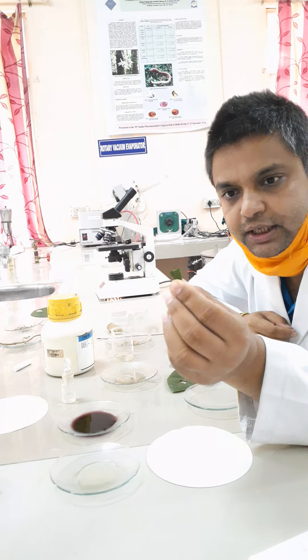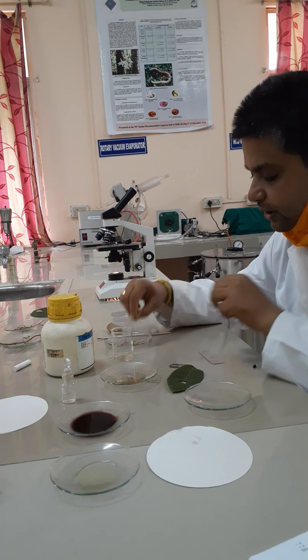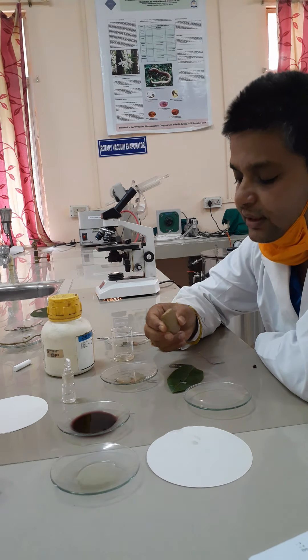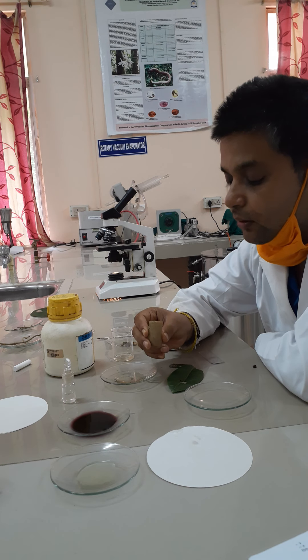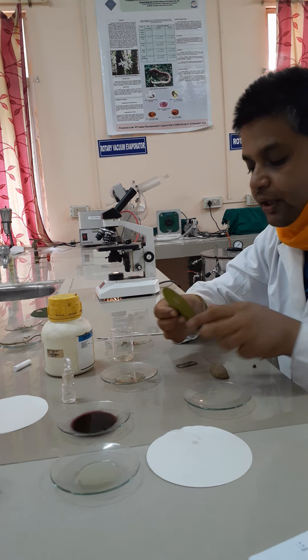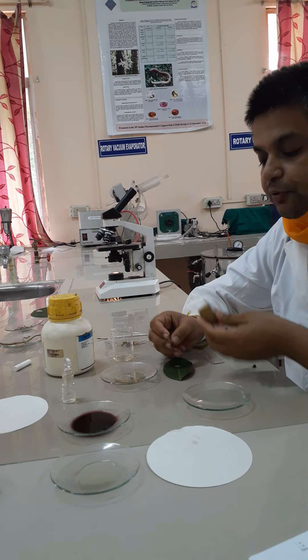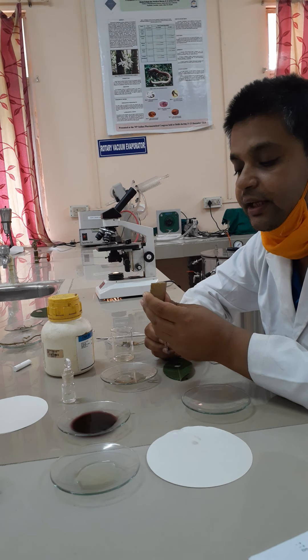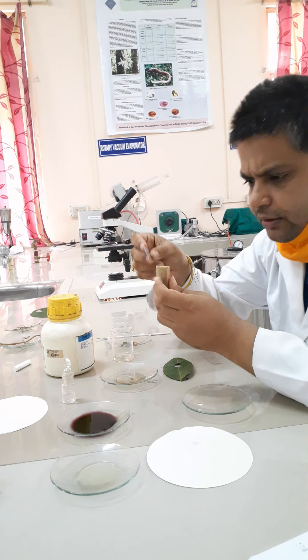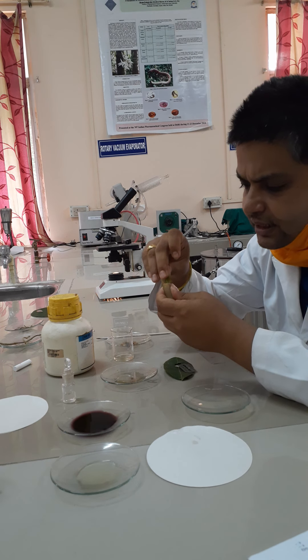We have taken a part which contains both the midrib and lamina. Soak it in water for some time. Then take a potato or papaya — anything — just for making the section in a smooth manner. As it is a leaf, it is very difficult to take the section directly, so to provide a sufficient strong base, we are using a potato. Cut the potato in between, and place your square-shaped leaf section in the middle.